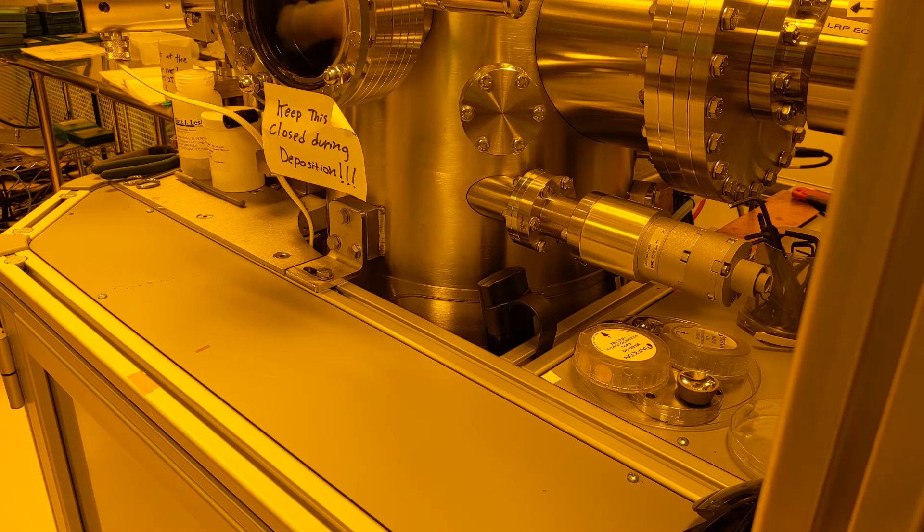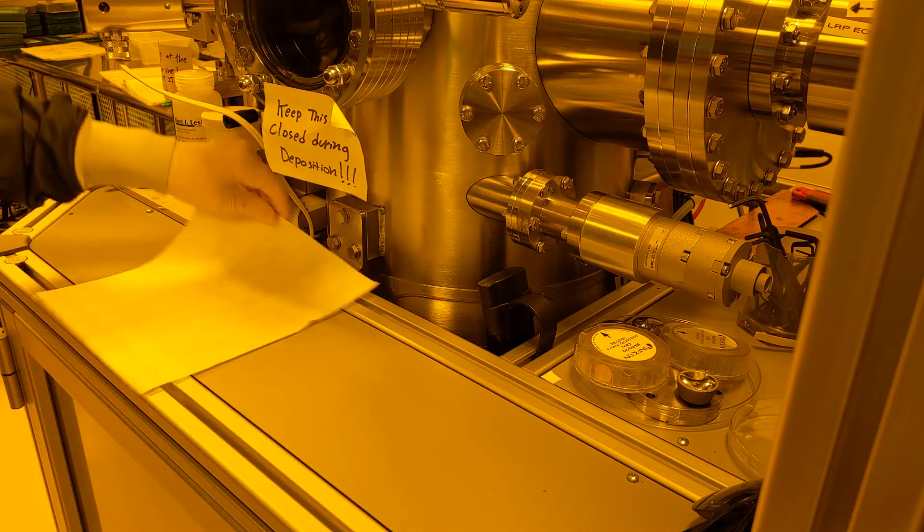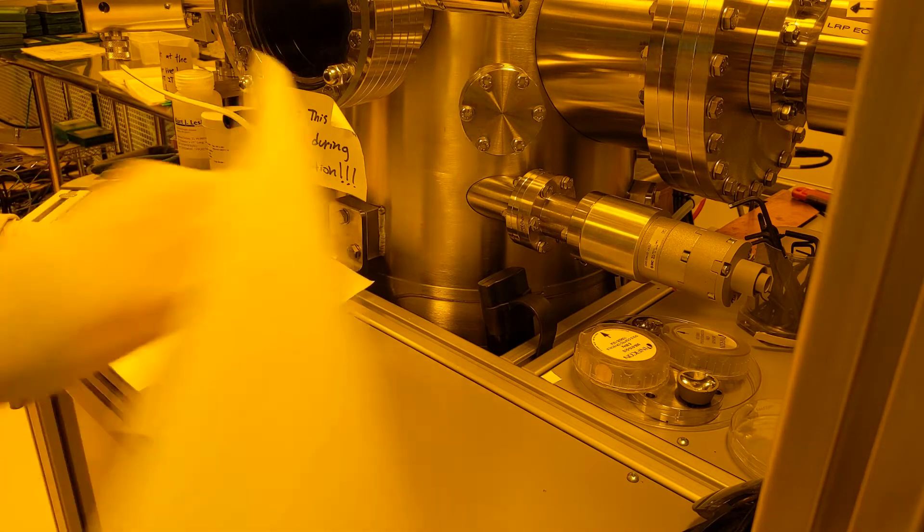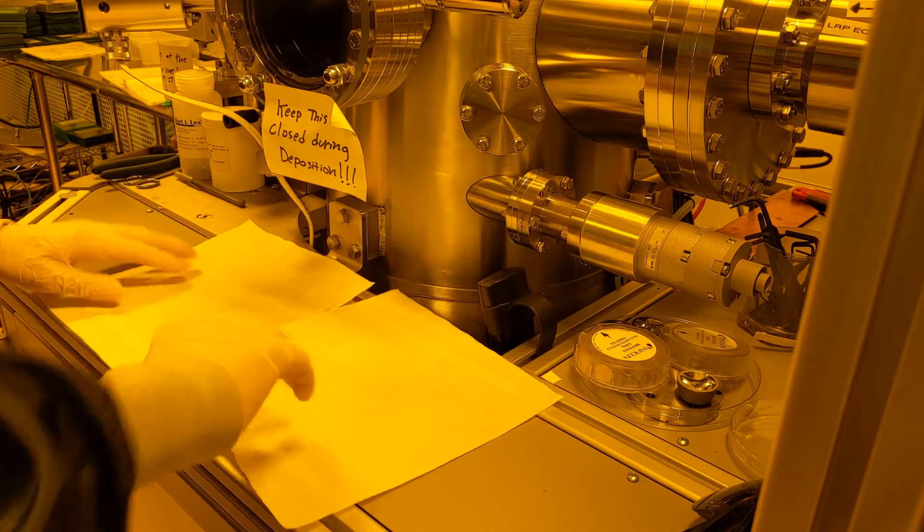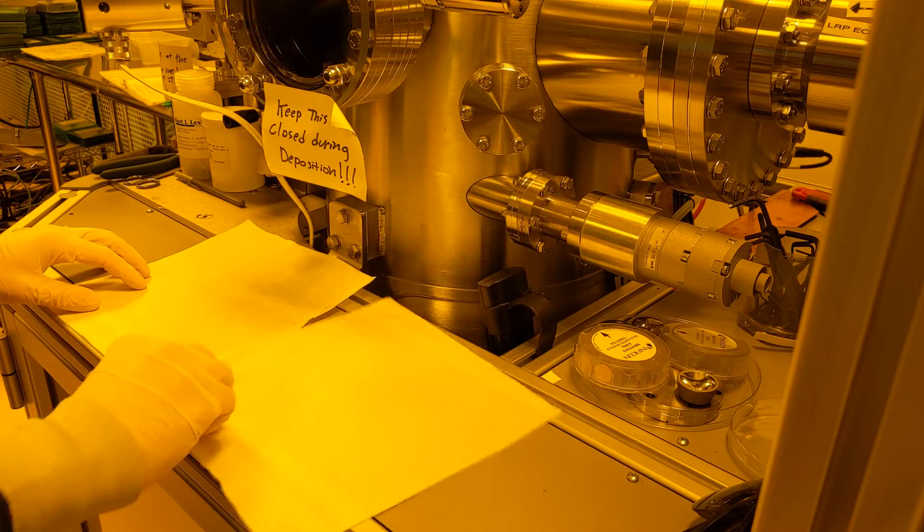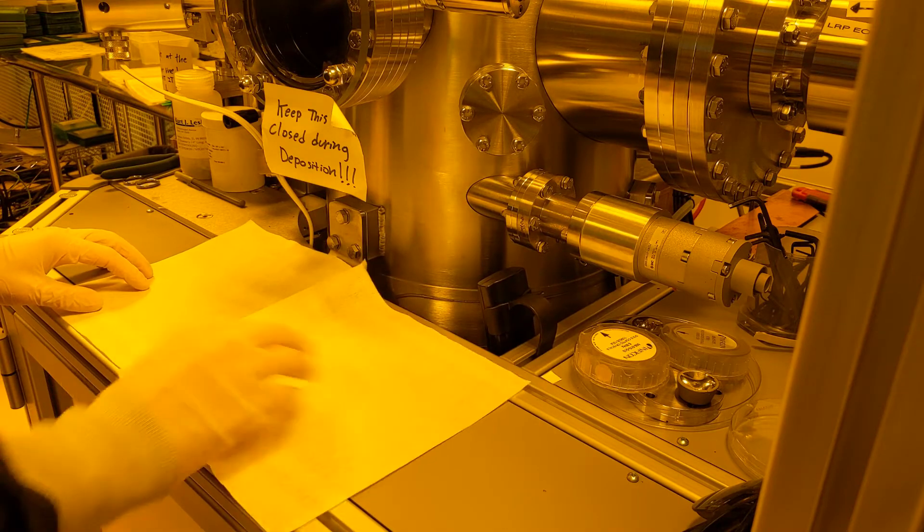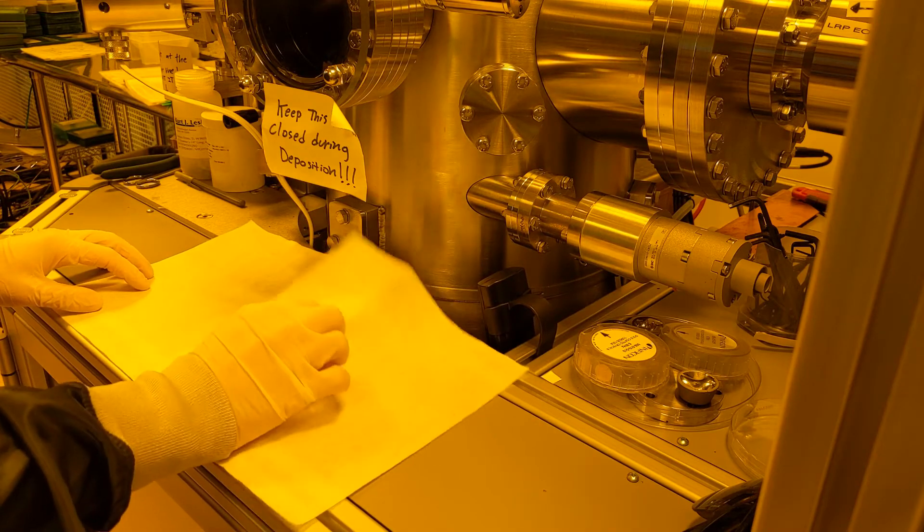First prep your area by placing down a few fresh tech swipes, then initiate the load lock venting process and clean any tools such as tweezers that you plan to use.